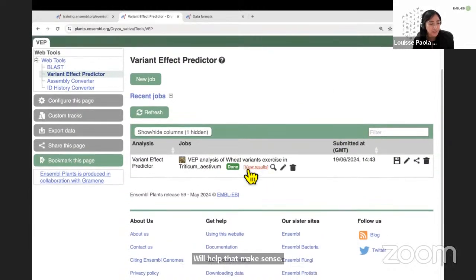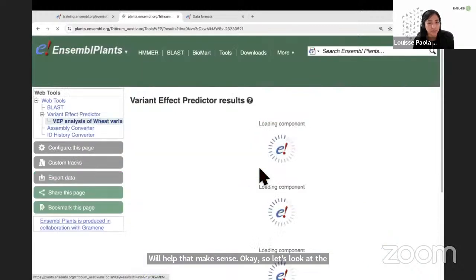Okay, so let's look at the results for our job here. You can click on View Results.